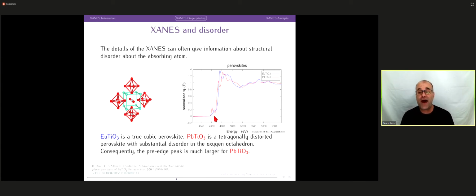And you see that at a glance because of this peak. I could go into a lot of depth on the physics behind the appearance of these peaks. It has to do with states that come out of a gap in the electronic structure of these materials. I could go on for quite a long time about that. It's sort of beyond the scope of what we're talking about.